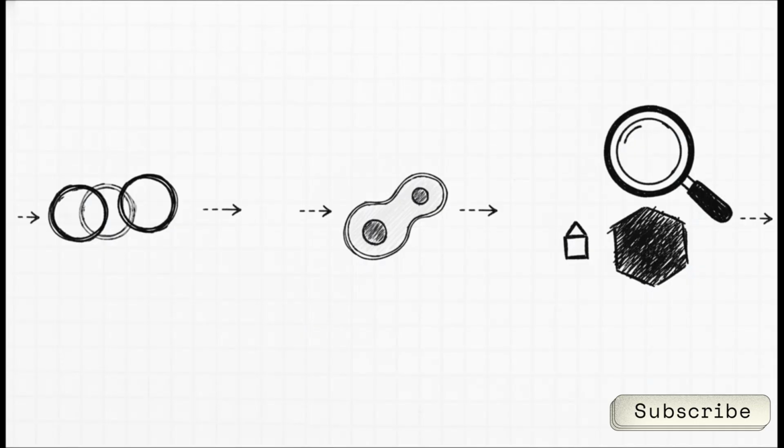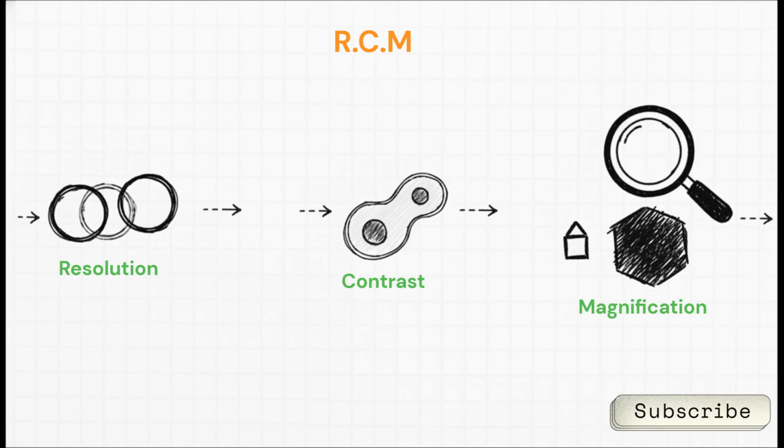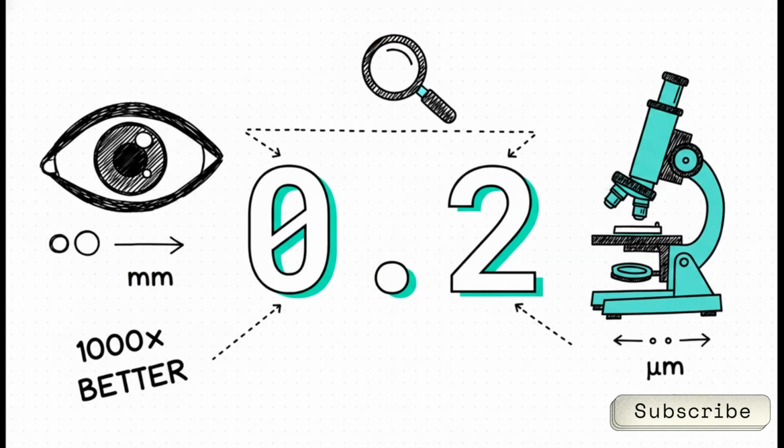Okay, want to guarantee full marks on a short note about microscope properties? Just use the mnemonic RCM. R stands for resolution, which is the ability to produce separate images of closely placed objects. C is for contrast, which we usually improve by staining our specimens. And M is for magnification. That's just the simple math of multiplying your 10x ocular lens by whatever objective lens you happen to be using, like 100x for oil immersion. So remember, RCM.